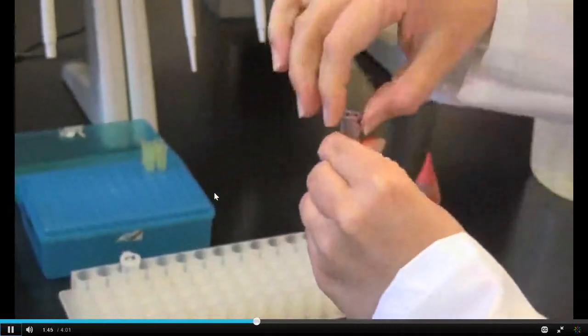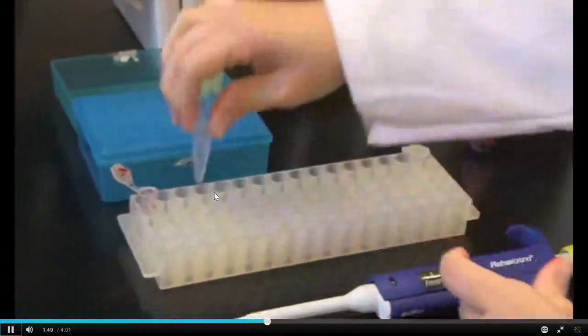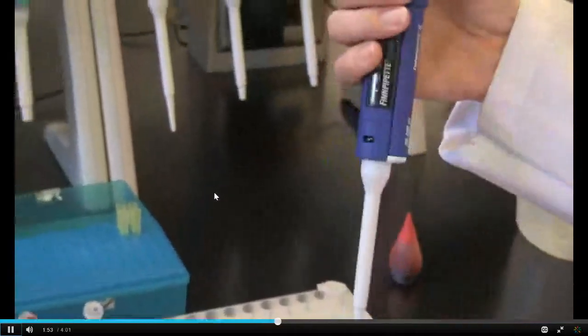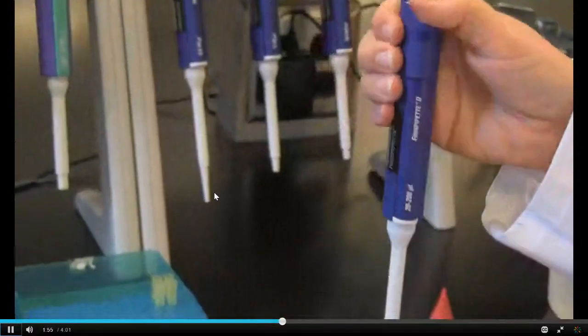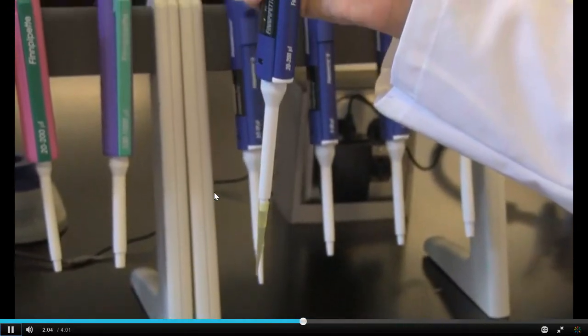Once you've set the micropipette volume, you should open the 1.5 milliliter tubes you wish to transfer liquid between. Pick up the micropipette and notice as you hold it, it hangs over your index finger with your thumb gently resting on the plunger. Now you can put a clean micropipette tip on the micropipette. Warn your students not to slam the micropipette into the tip box.